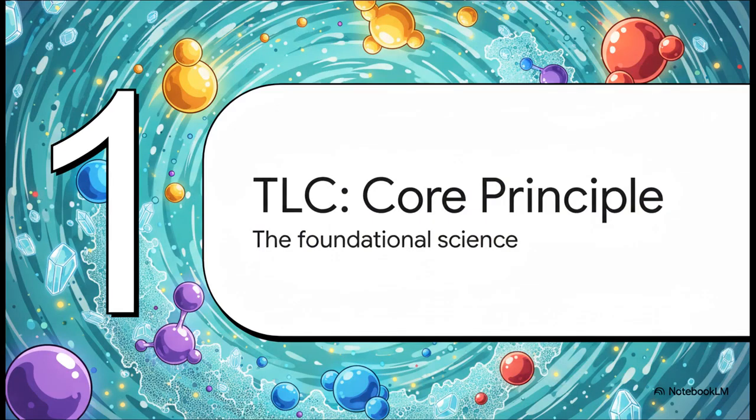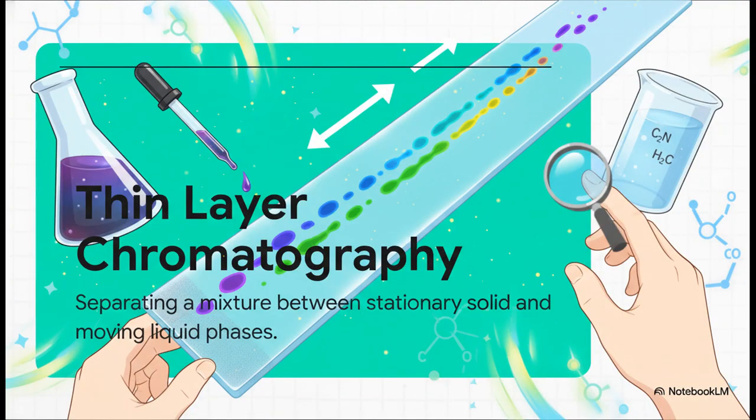All right, Section 1. TLC, the core principle. So, thin layer chromatography. At its heart, it's essentially a physical method of separation. It works by distributing the components of a mixture between two very distinct phases. You have a stationary solid phase and a moving liquid mobile phase. The absolutely crucial point to grasp here is that this separation relies entirely on how different analytes climb up the plate at different rates. Because different molecules have varying affinities for the solid plate versus the moving liquid, they quite literally get pulled apart over time.